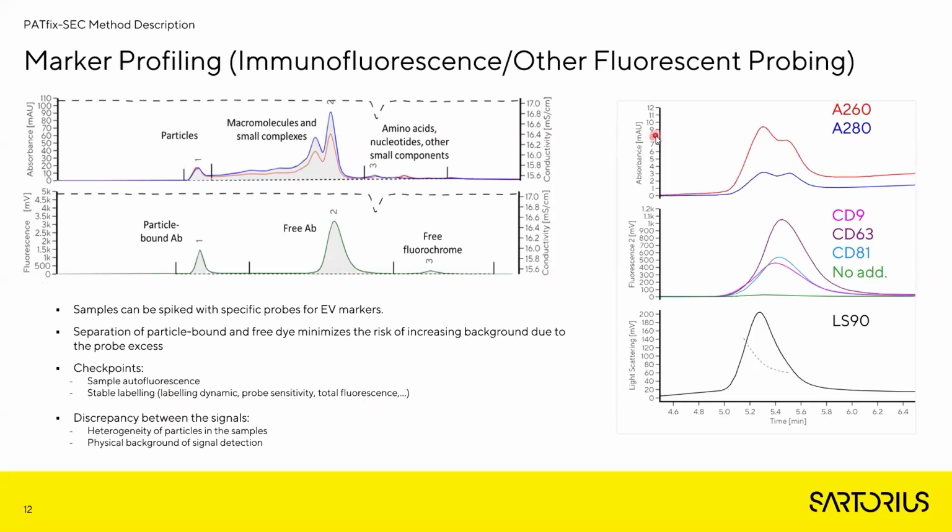Compiling the results of absorbance, fluorescence, and light scattering can already provide us some information about the heterogeneity of the sample. However, interpreting this discrepancy must be made with attention to the different physical background of detection for different signals.